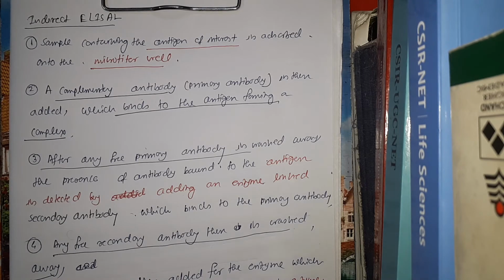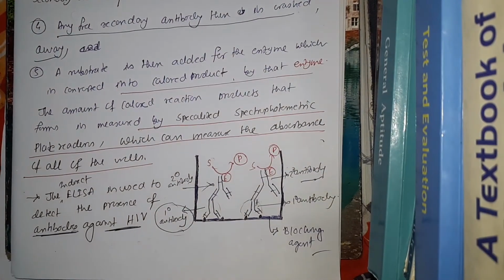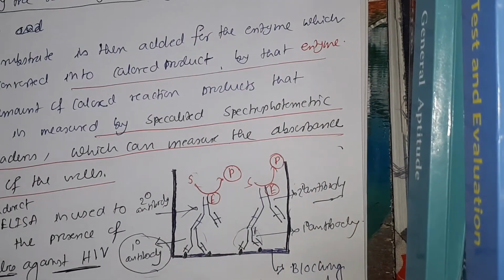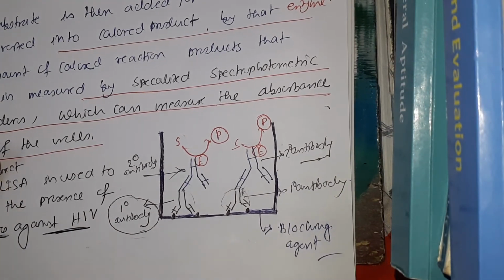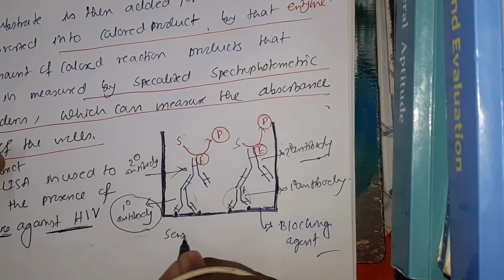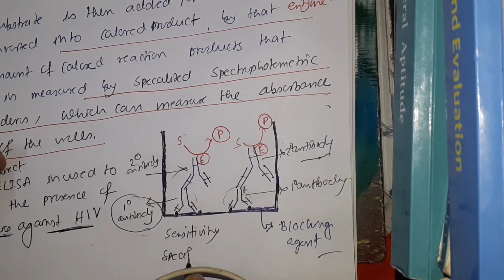Indirect ELISA simply increases the sensitivity of the test. The two problems that we face in case of direct ELISA are sensitivity and specificity.